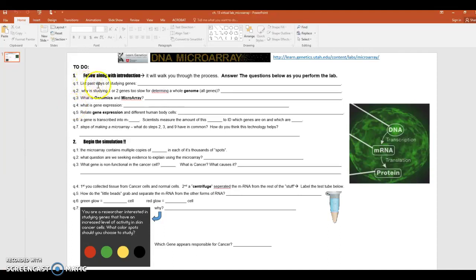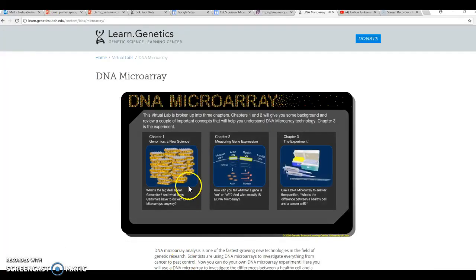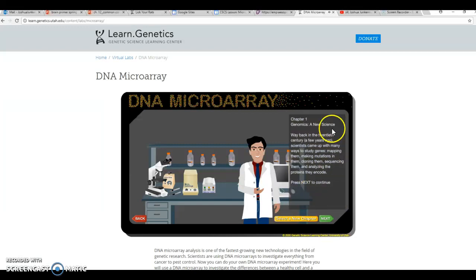Question number 1, it says, list past ways of studying genes. So let's do that. You click here, and then you just click on chapter 1. So you go one chapter at a time, right? So click on chapter 1, and you can see how visual it is.